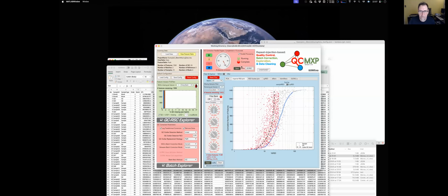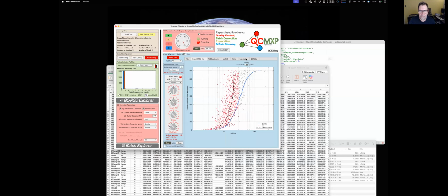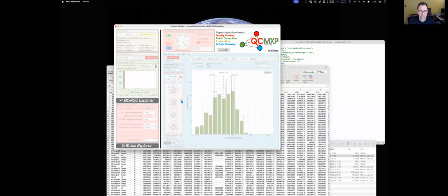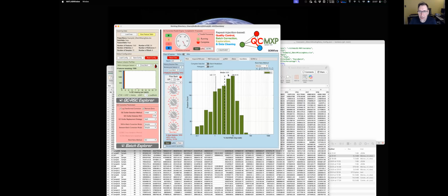Yeah, I kind of, okay, let's switch this off. I kind of dodged talking about it too much because I knew that we only had an hour. So the blank ratio is basically, if I go to this, let's pull up.